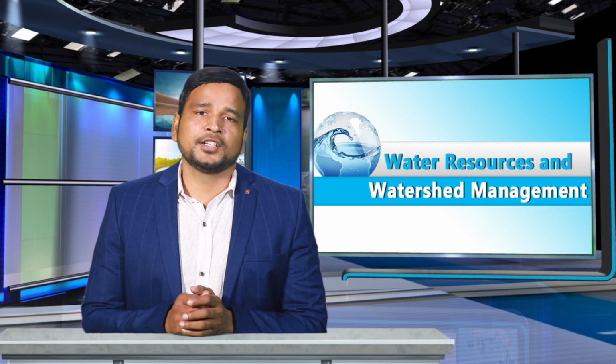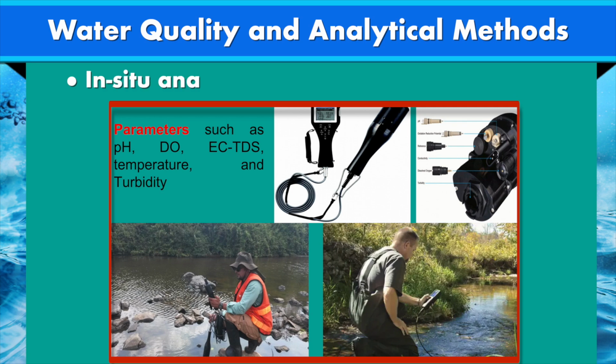In the last part, we will discuss analysis of water samples. Do you know, in water quality, certain parameters should be analyzed in situ or on site immediately after the sampling to avoid physiochemical changes that may occur during transit and storage. Parameters such as temperature, pH, DO, electrolyte conductivity, TDS and turbidity should be measured using portable multimeters.